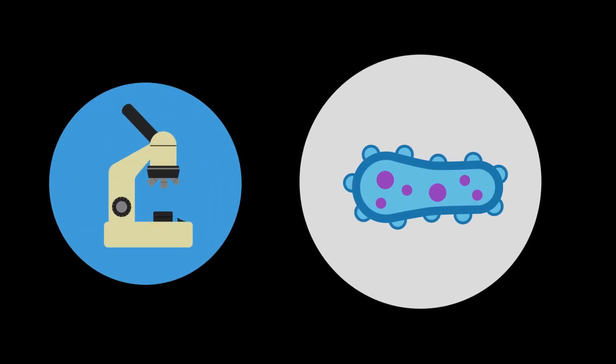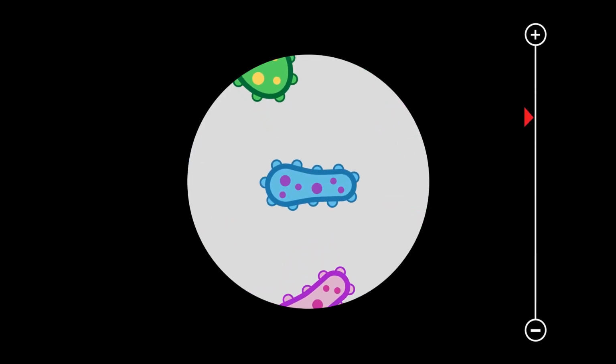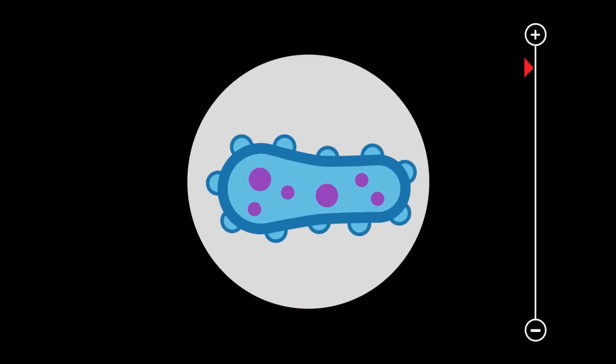Microorganisms are so called because they can only be seen using a microscope. They are far too small to be seen with the naked eye. In fact, the invention of the light microscope opens up a whole new world to scientists, the microscopic world. A microscope magnifies objects and makes a larger image. This allows us to see objects in more detail.